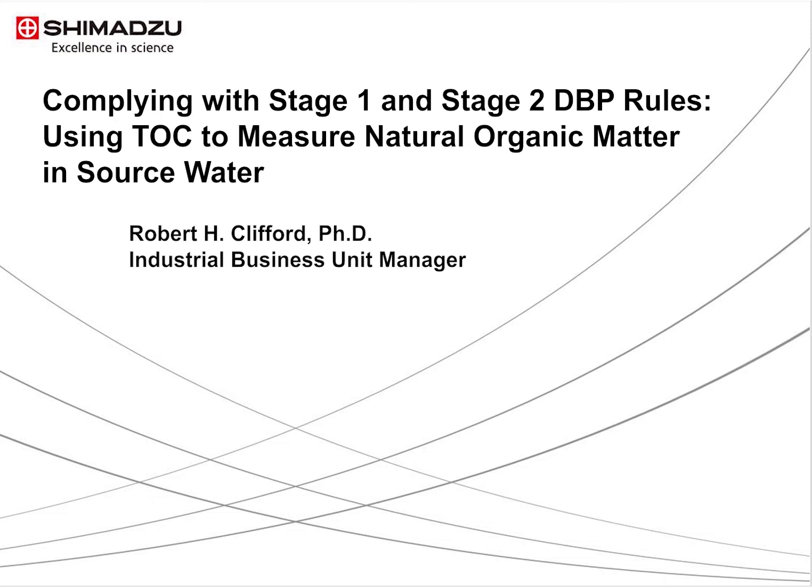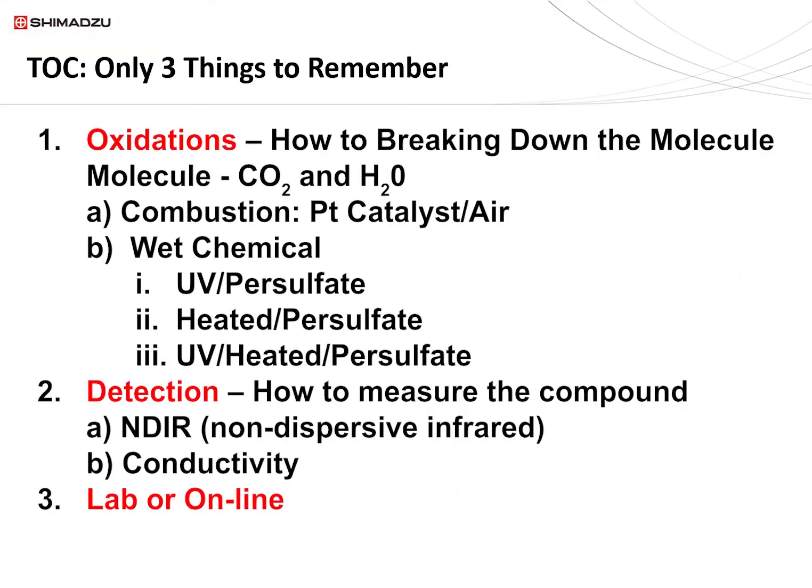Before beginning the discussion on disinfectant byproducts, I would like to give you a quick overview of the TOC terms. For TOC, there are only three things to remember. First, oxidation, or how to break down the carbon-based material. Second, how to detect the material broken down. And third, is a laboratory or online instrument required?